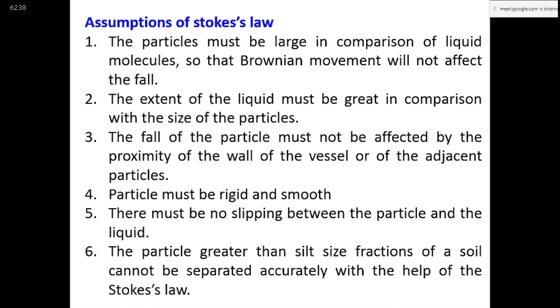Third, the fall of the particle must not be affected by the proximity of the wall of the vessel or adjacent particles. So we have to use such an instrument or cylinder that does not affect the proximity.